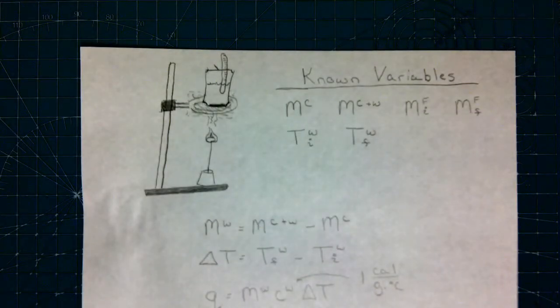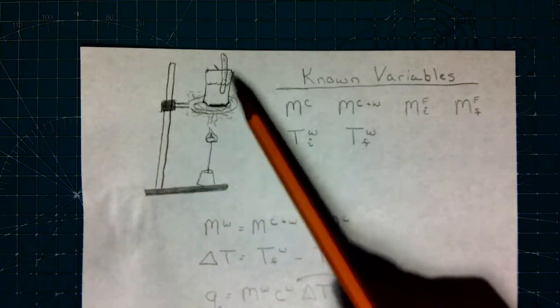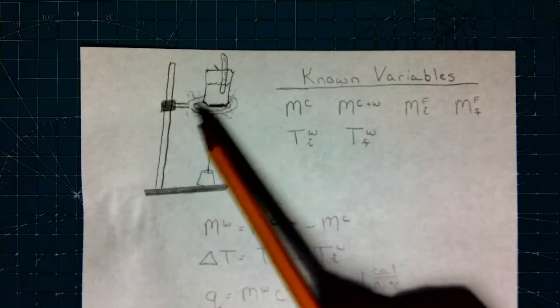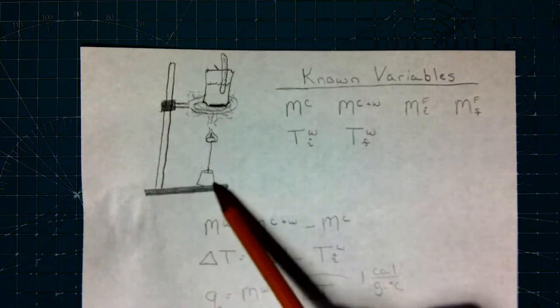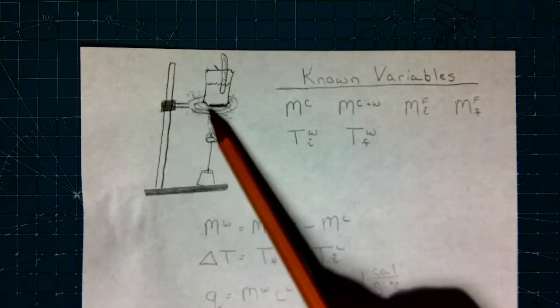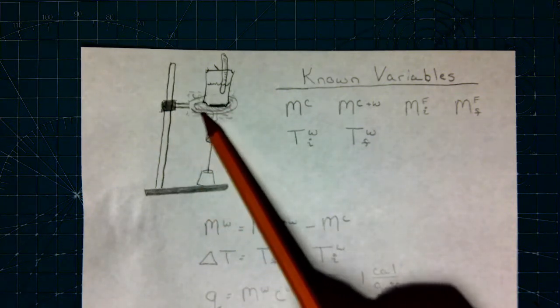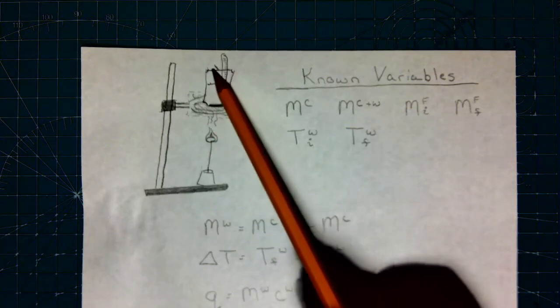In the next part of this report, we're going to do a little experiment to find the caloric content of some food. So in this scenario, you have a ring stand. That's what this thing's called. And you put a little metal ring that clamps on here. And there's going to be some wire gauze here. And you're going to use that to hold up a metal pop can.